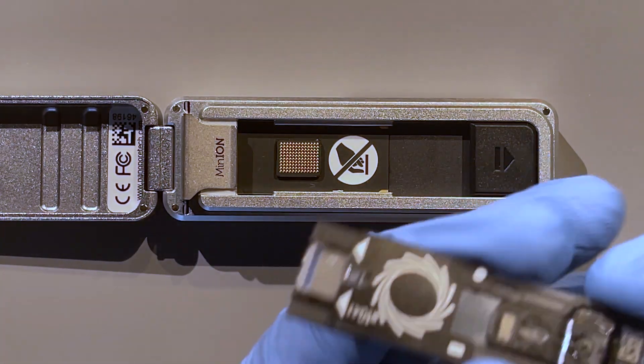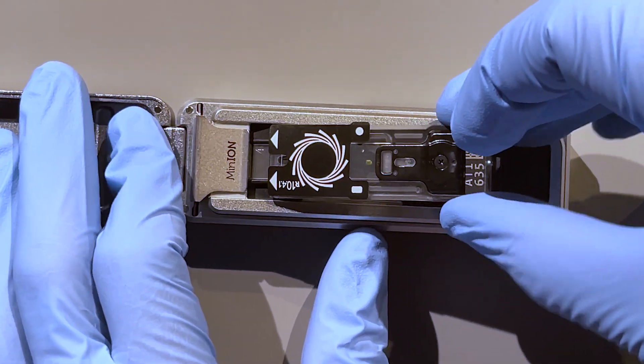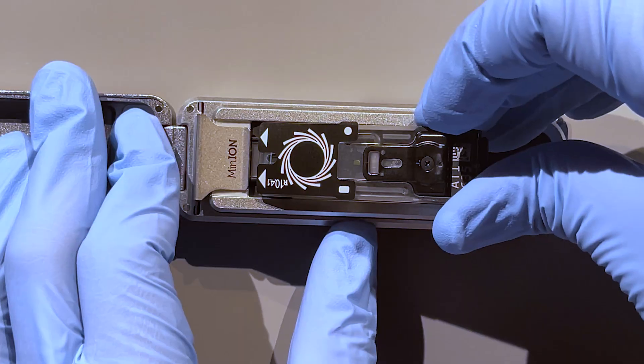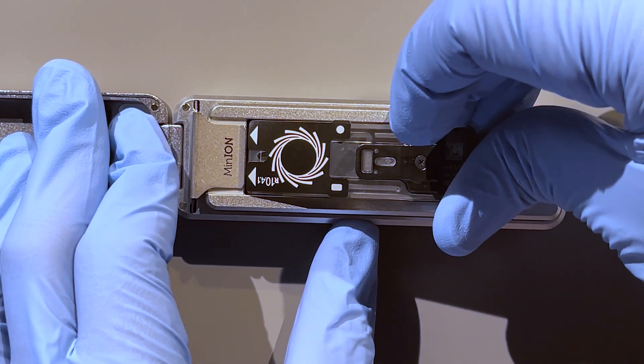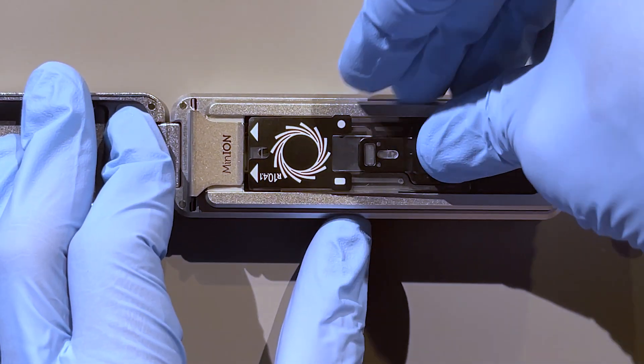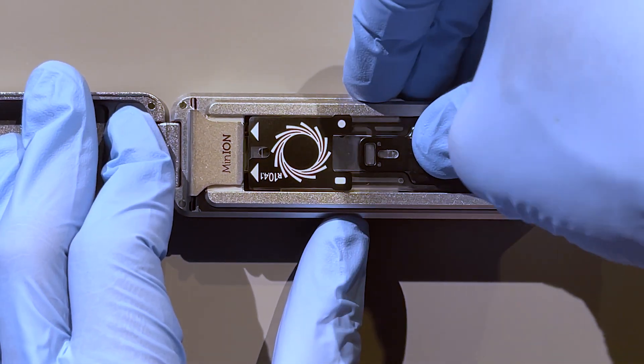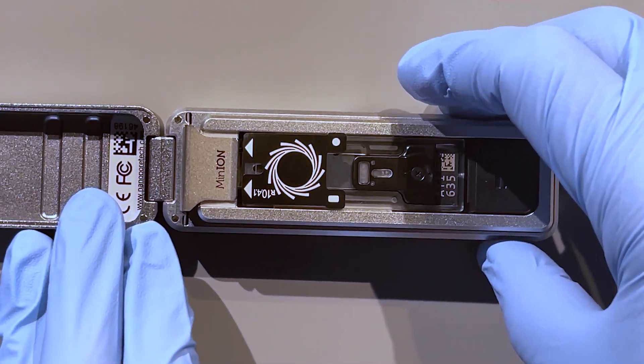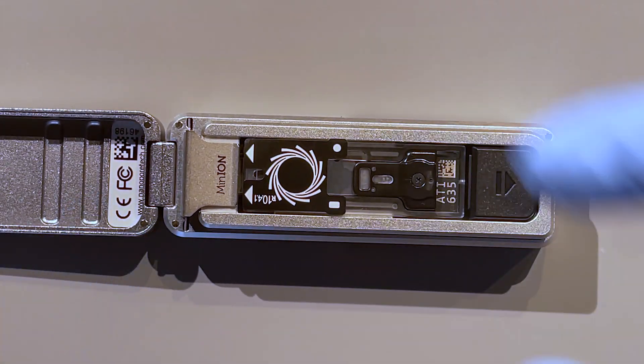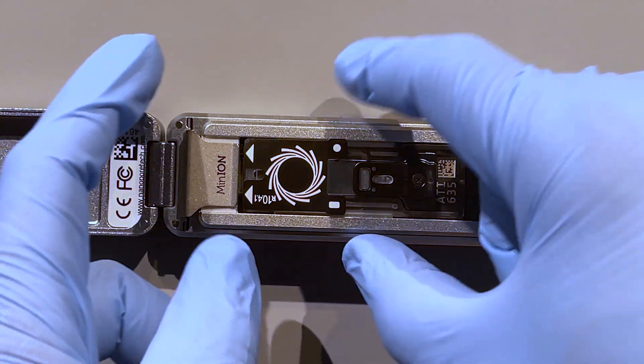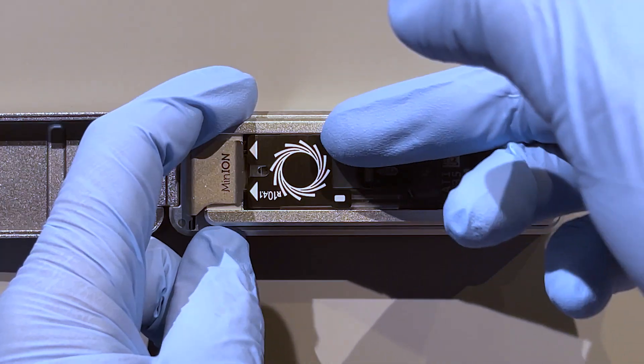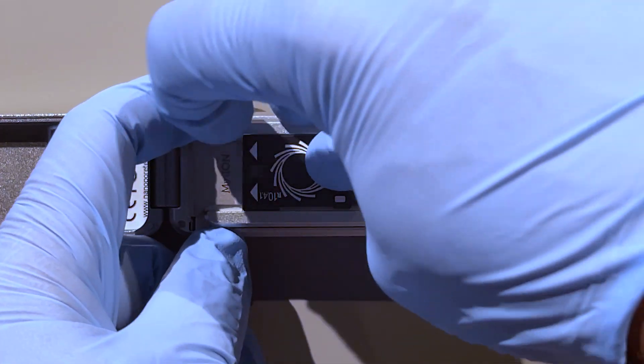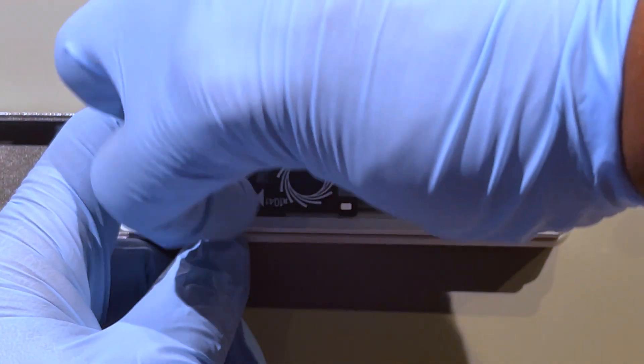I'll show that at some point how to do that in a different video. But if the flow cell was below warranty, you wouldn't want to use it and load a library onto it. That's a bit risky. Okay, so I have the flow cell here, and I'm going to go ahead and stick that in.